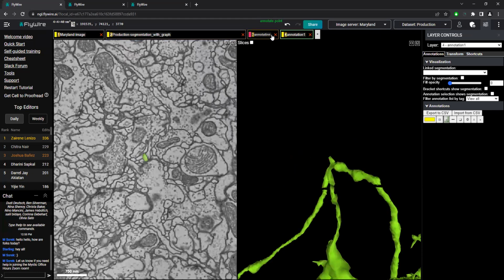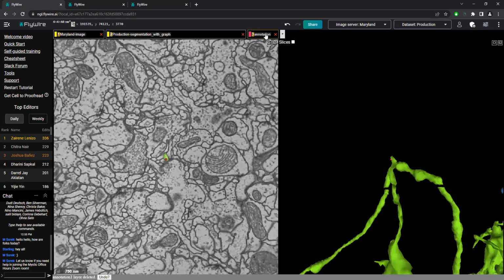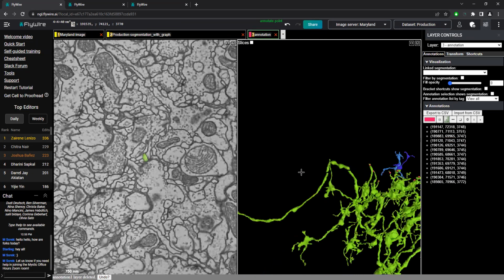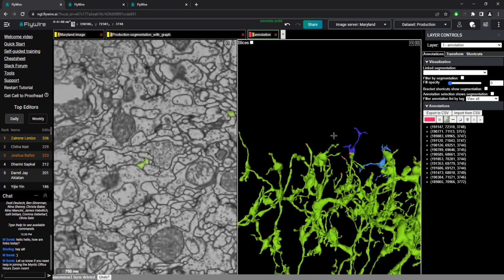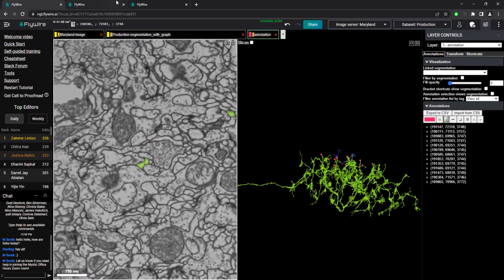So I'll get rid of this one. Let's see here, what layer are we on? Oh, we don't care about that layer. There we go. And that highlights that one right there, and just delete that. So we'll definitely make some short little videos, I think, for using some of these more annotation point heavy things, especially in regards to misalignment jumps.